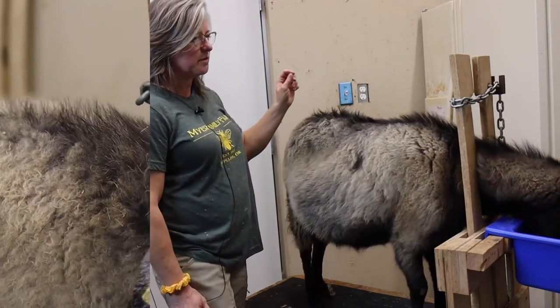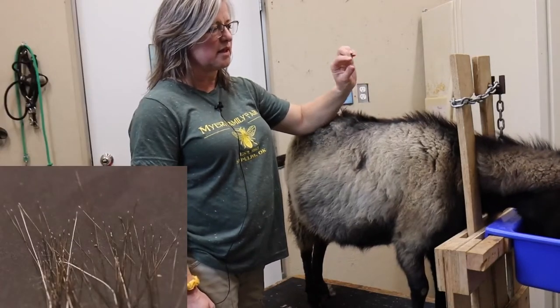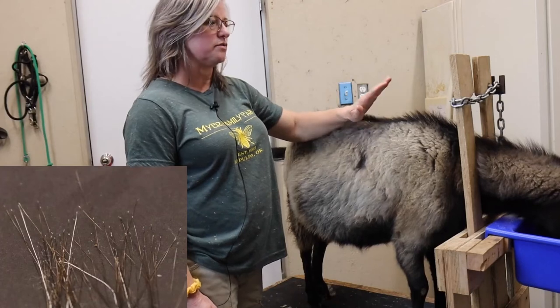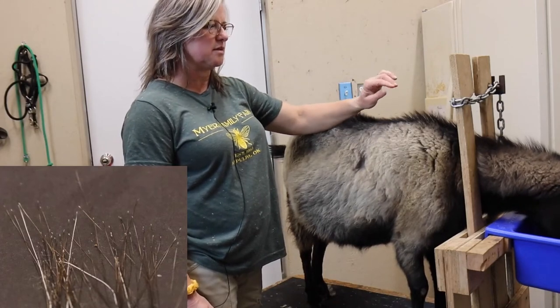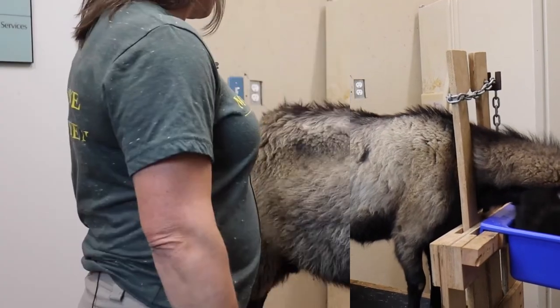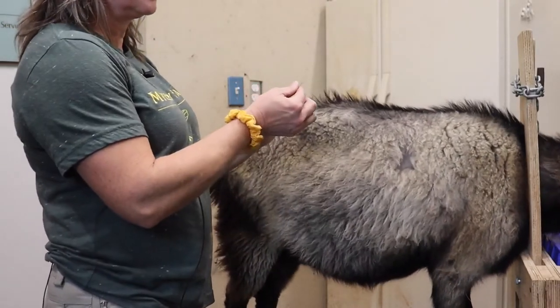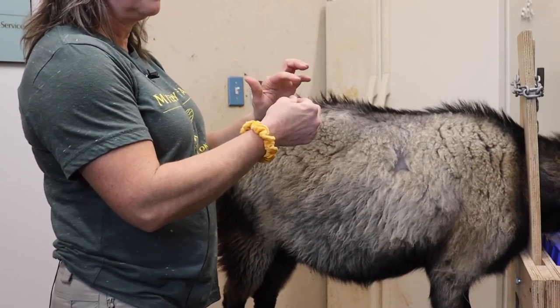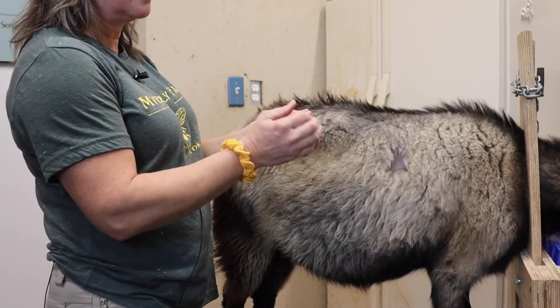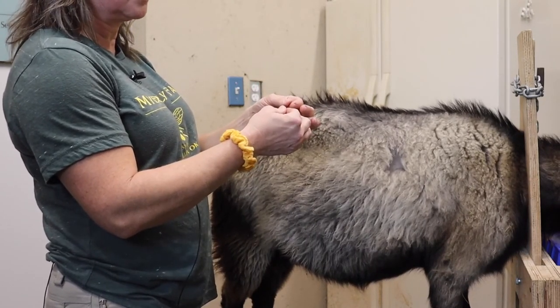We have to make sure that when you do the guard hair, you get the follicle bulb that's at the end of the guard hair. There's no DNA in the guard hair itself, so if we don't have the follicle bulb on the end, the sample will not be usable. You need to look at it and make sure that you have the bulb on there, and you'll need at least 20 hairs that have the bulb on them in order to extract enough DNA.